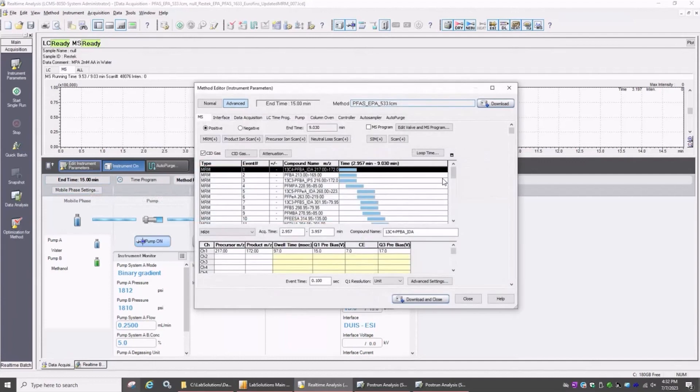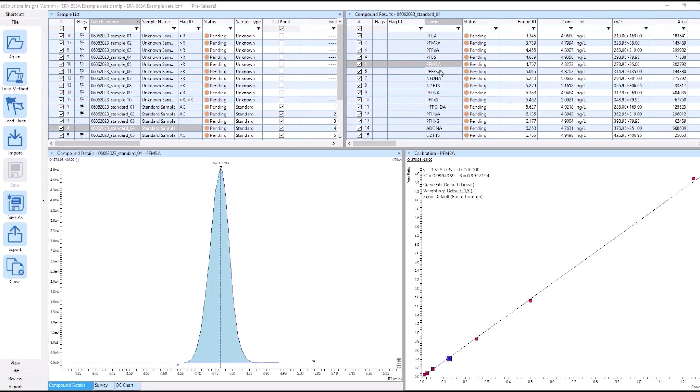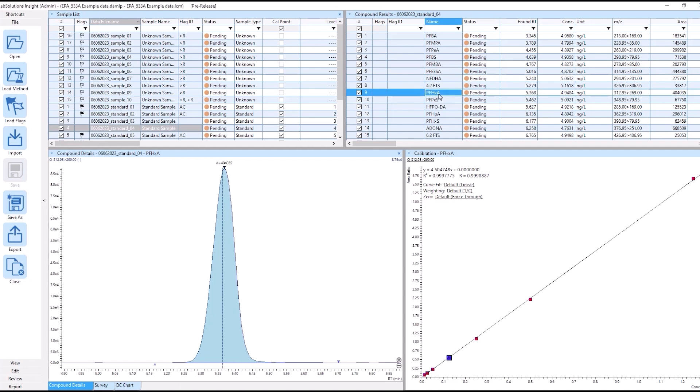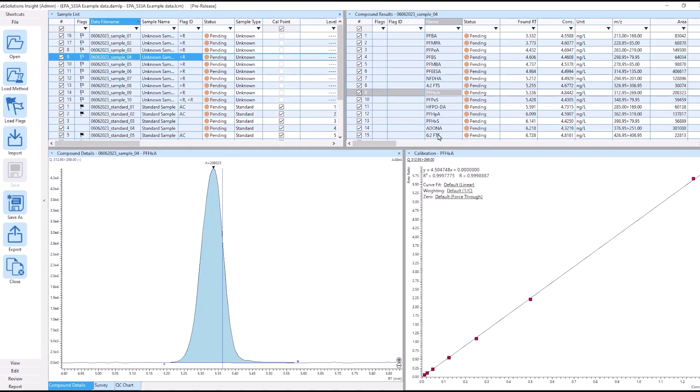When finished, the user can begin acquiring data. Once the data is acquired, the entire data set can easily be processed and reviewed using the Lab Solutions Insight software.